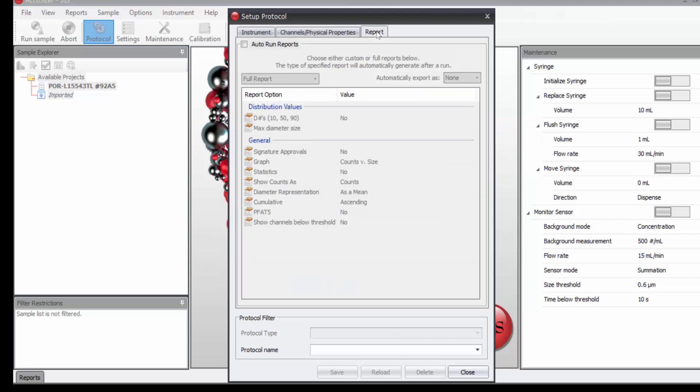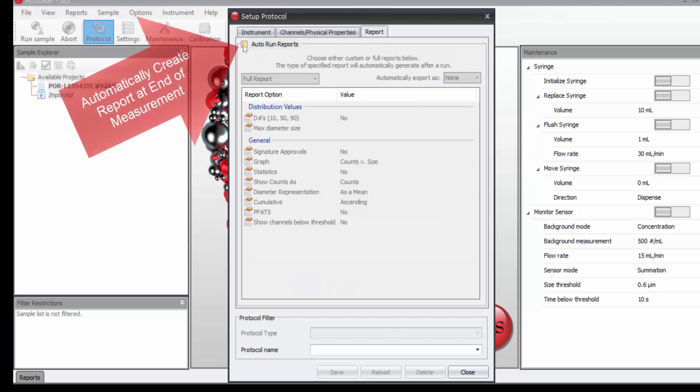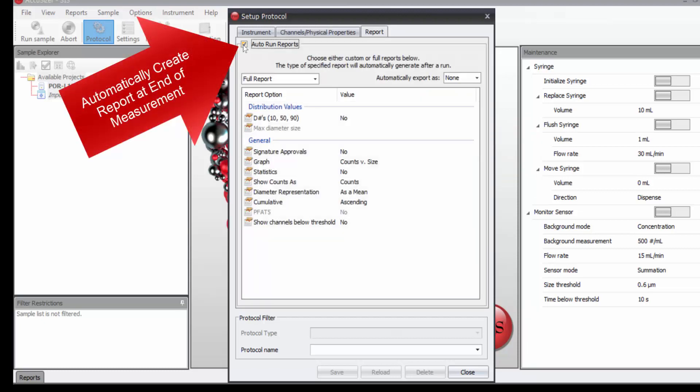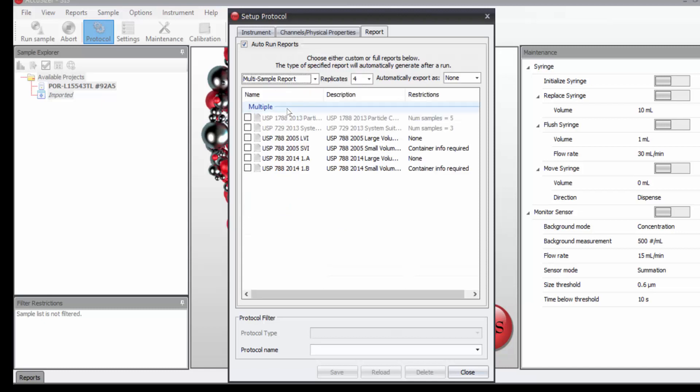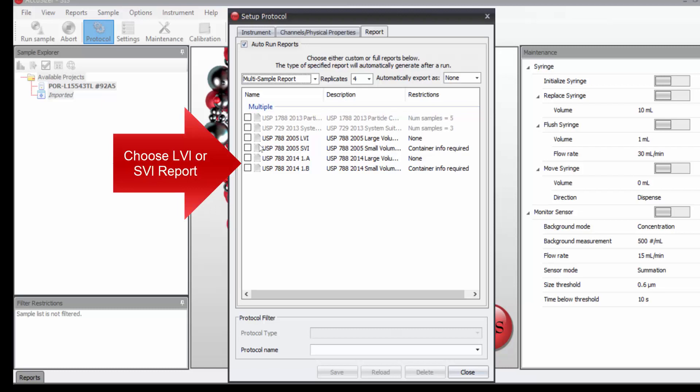Then on the report tab, I may choose to automatically run the USP 788 report at the end of the measurement. So what I do is I click on auto run reports, come down here to multi-sample report, choose USP 788 SVI here.